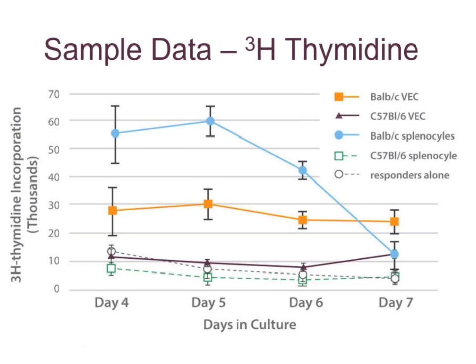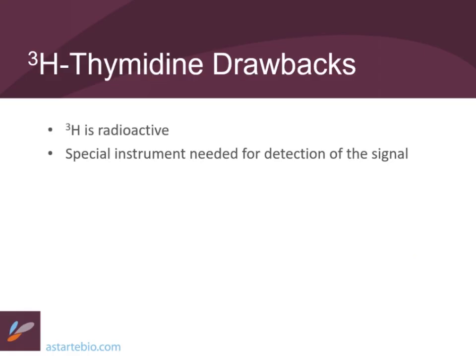That's one of the features of this type of assay, that you need to choose your time point, because we're adding thymidine for 18 hours and then looking at what's incorporated into the cell. You want to get it during that time when S phase is underway, and that is going to come to an end, as shown here. By day 7, the action's over. So an experiment like this is suggested, within each laboratory, to find the day that works best under your conditions.